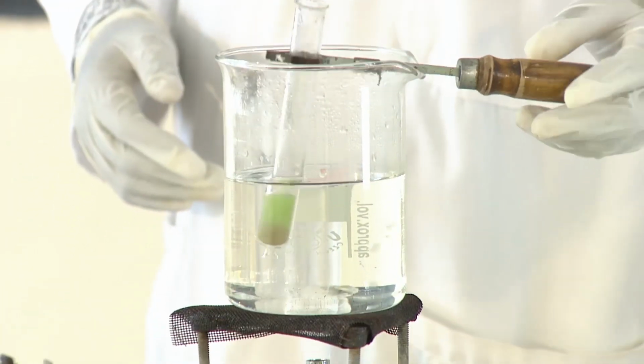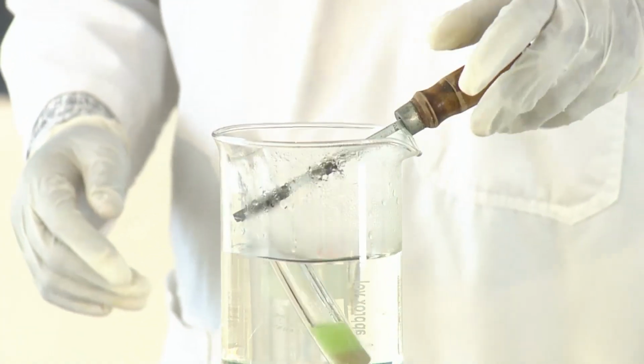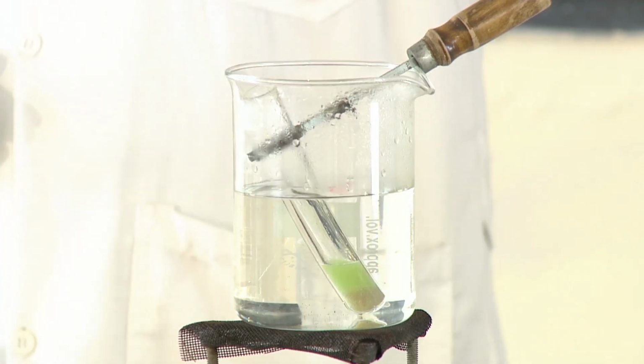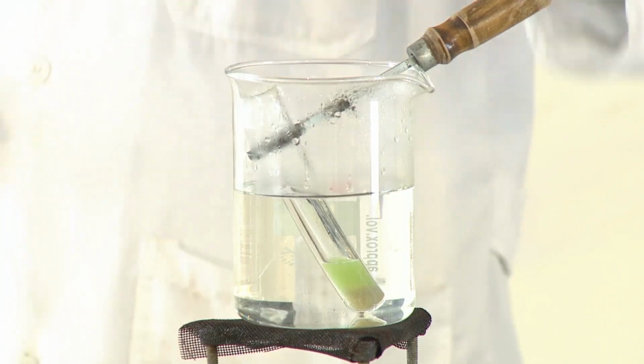Let us note something on a chalkboard, and then we write it. Meanwhile, we need to wait and see if it changes from green to yellow and finally to orange or moderate orange.